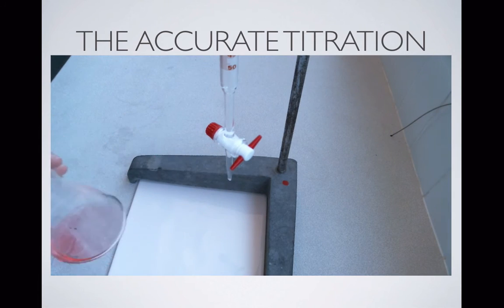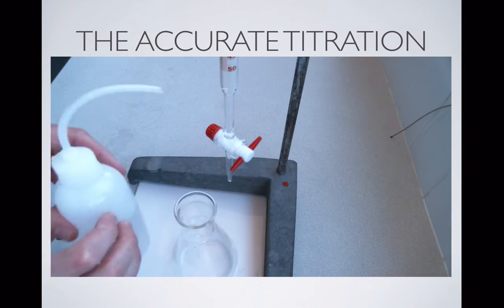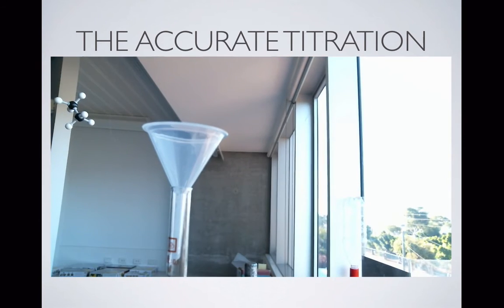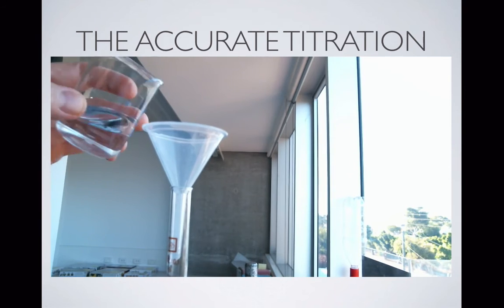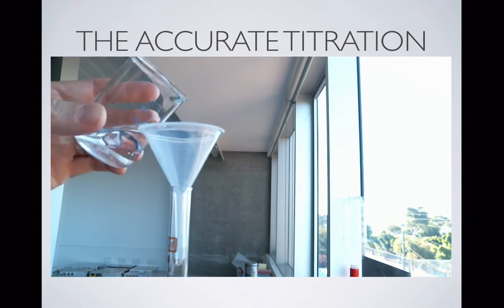Alright, so first we're going to empty out our flask from the last titration. We're then going to give that a good rinse with distilled water. We don't have to dry it out afterwards because the distilled water is not going to react with anything, so it doesn't matter how much is in the flask. Might just top up our burette if we think we haven't got enough liquid in there for another titration.